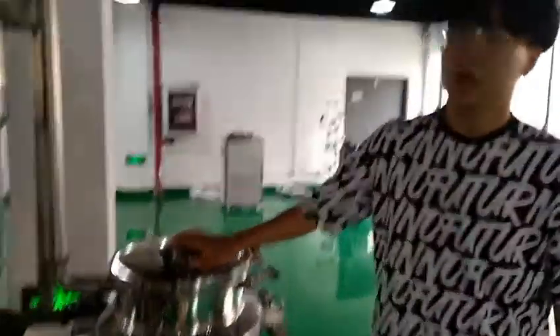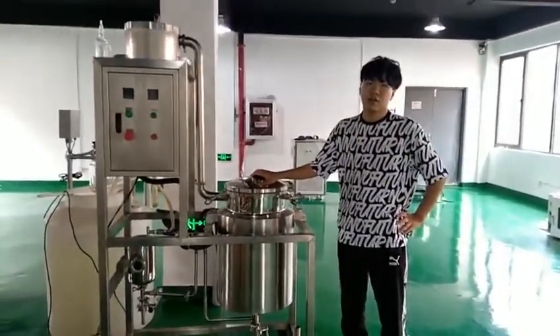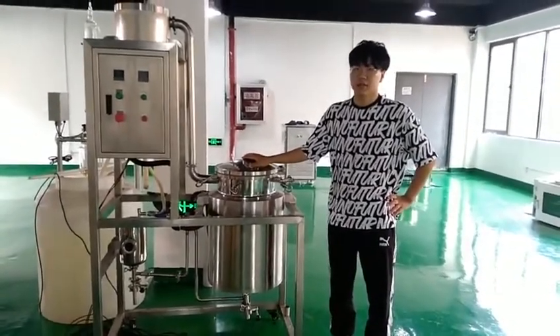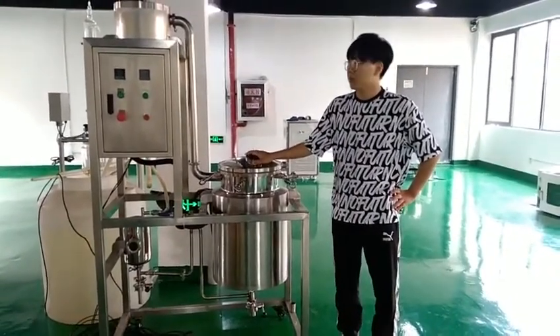This essential oil extraction machine can be used to extract some flowers, plants, leaves, and woods. I hope you will be interested in our machine.